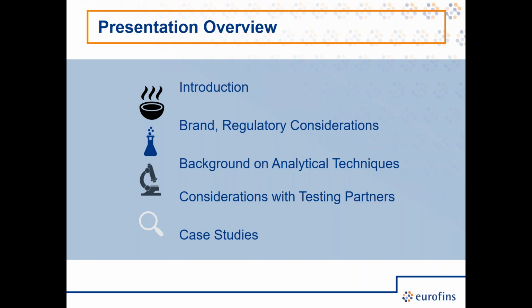Then we'll really get into the meat and potatoes of the presentation, which is really background on the actual analytical techniques, the instruments, how they work, what they're useful for, how to put them all together to solve problems. Then there are some considerations you need to think about if you do decide to engage with an external testing partner or outside laboratory.